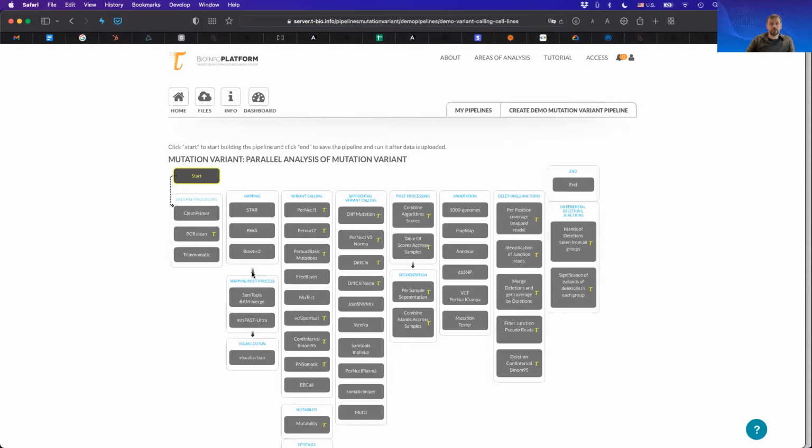Once you're in, you'll see that each button here represents an algorithm or a script. Just like what we did there in R, that's a script. I can make it into a standalone script provided with some inputs, and it's going to run every time I call it. So here I have many different scripts, and my goal is to piece them together into a series of scripts that we will call a pipeline.